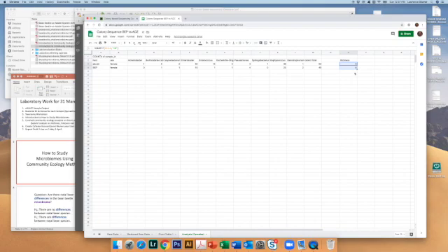The other thing that we wanted to evaluate is, well, there's several things. This isn't in your handout, but I suggest you do it. The thing that's not captured by doing the richness calculation is what genera are actually dominant here. And really asking the question, are the same genera equally dominant? And I would just look at this and identify the genera that appear to be most common. And it looks like, at least in Adzuki, colonies isolated from Adzuki bean females include Enterobacter, Enterococcus, and Staphylococcus.